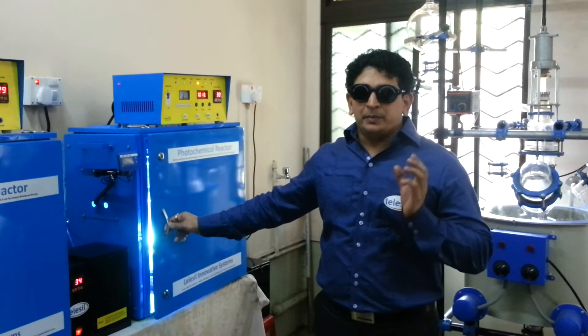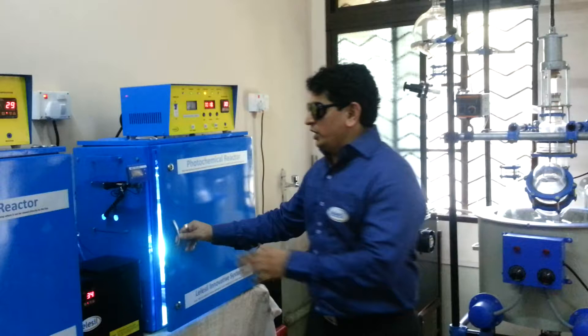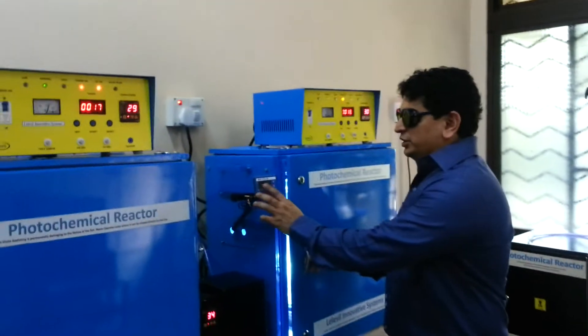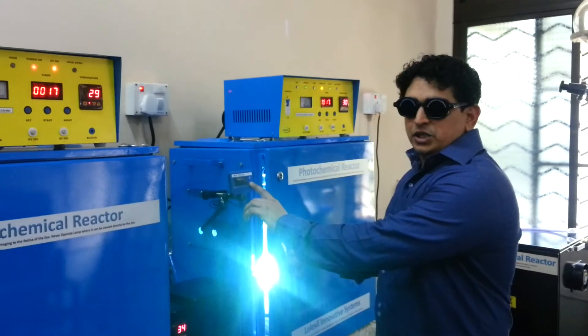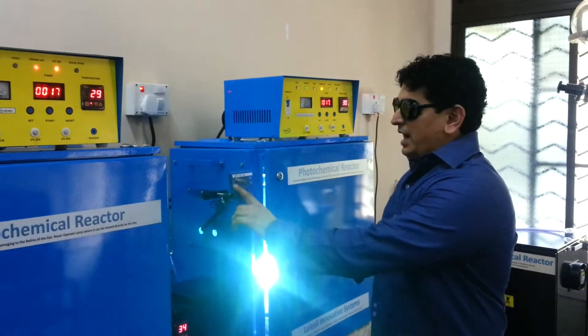For chemical or pesticide degradation, you have a special display outside where you could control the hot plate temperature or the temperature of your reactor using IDVA system.